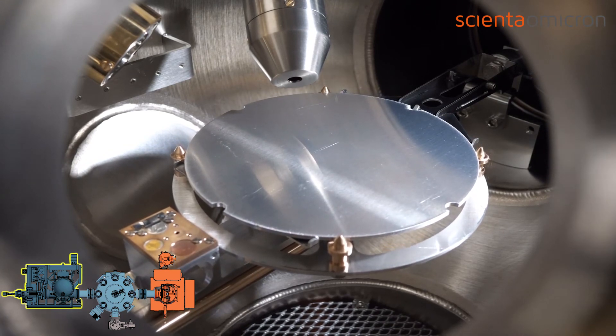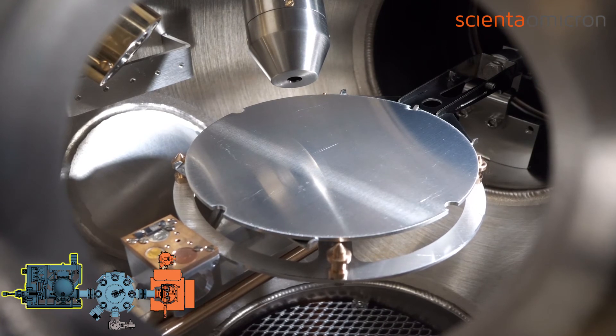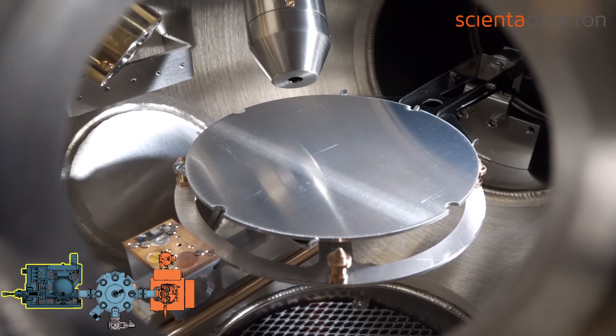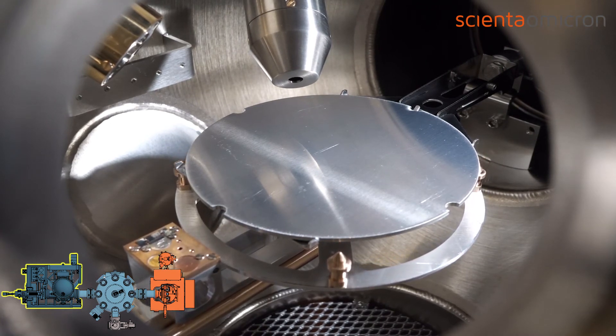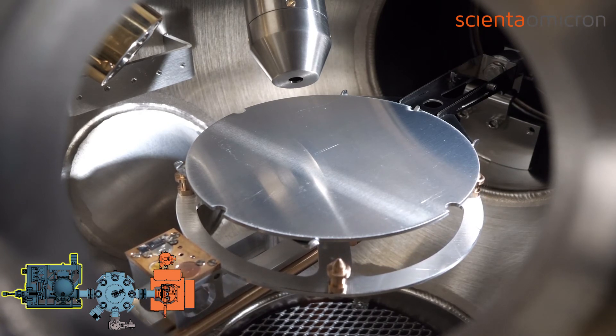As soon as the wafer fork is positioned below the sample in the transfer position, the XPS manipulator is lowered until the wafer holder is placed on the fork acceptor, and safe retraction of the arm is enabled. The arm then retracts back into the radial distribution chamber.